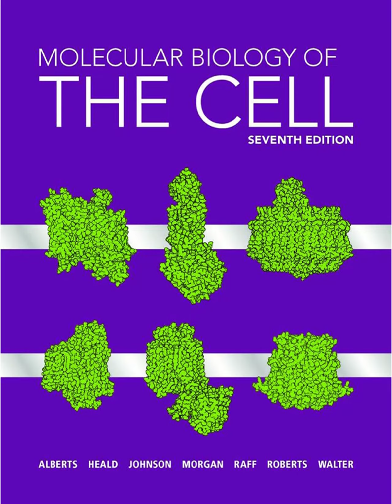Exactly. You generate a high-resolution 3D EM volume of the cell, and because you know the original fluorescence coordinates, you can precisely map those fluorescent signals onto the 3D ultrastructure. It gives incredibly precise correlation, down to maybe 5 nanometer accuracy. It's very powerful, but technically demanding.